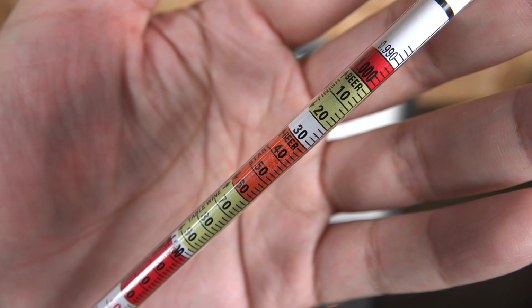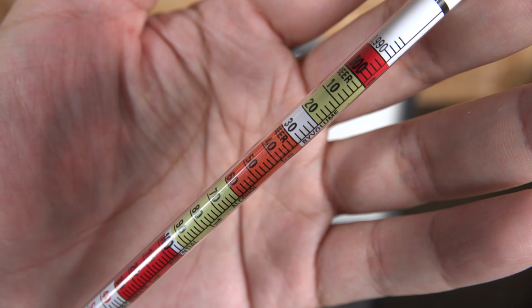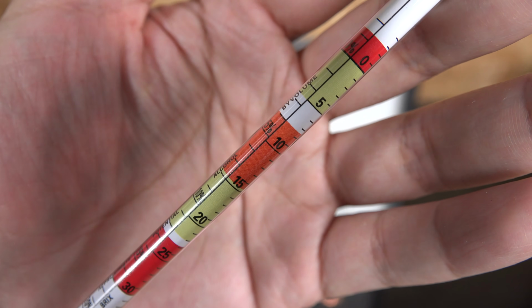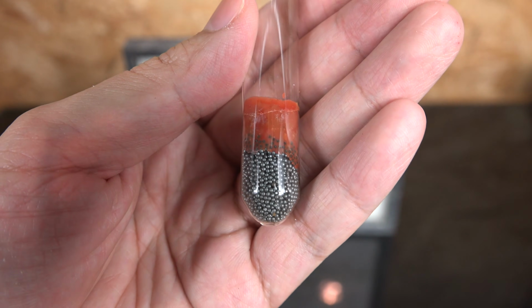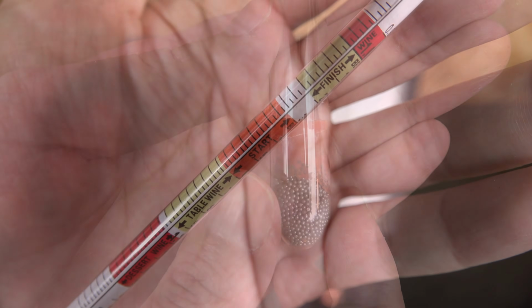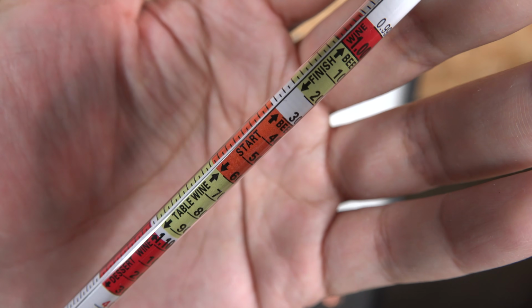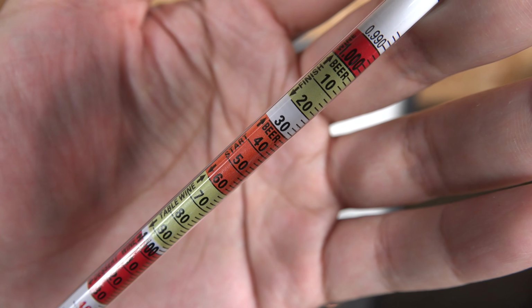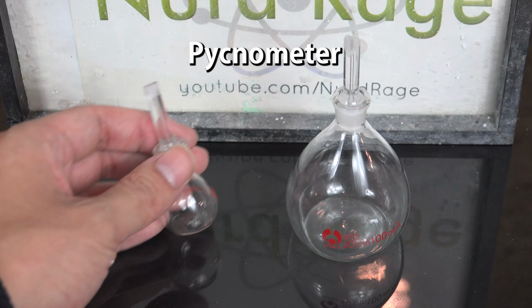Also, the cheap domestic ones tend to be poor quality. The scale is just a rolled up sheet of paper and can slip, destroying the accuracy. I have a couple where the paper actually fell out and landed in the bulb. So these are good for quick and crude measurements, but for high quality analytical work, we're going to need something better. And these are pycnometers.